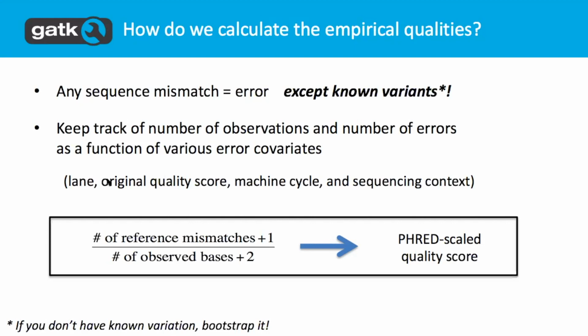All right. So essentially what Geraldine was trying to say is that this error model is created by first masking out all the known variants. For example, we use dbSNP to see what the known variants are and mask those out, and then create the error model on the rest of the mismatches. So anything that's not a known variant is assumed to be an error, and then the model is created on top of that.